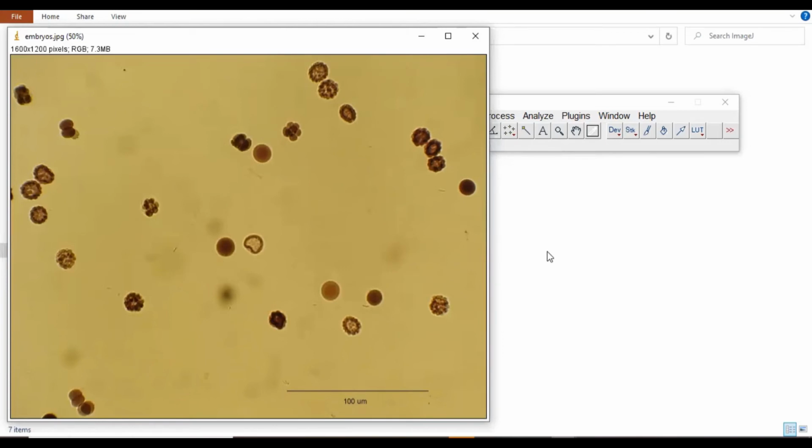There are certain factors which one needs to consider when measuring the average particle size. One, how are the particles? Are they evenly distributed? Are they distinguishable? Or are they of micro size? So it's really preferable when measuring the average particle size to have particles that are distinguishable and also micro particles.